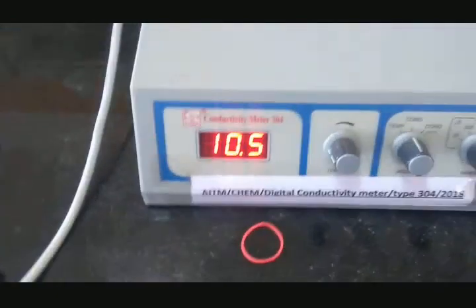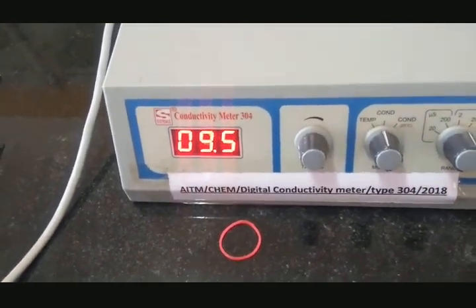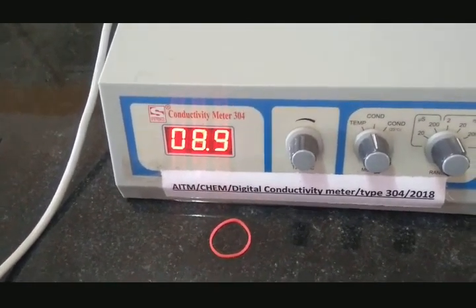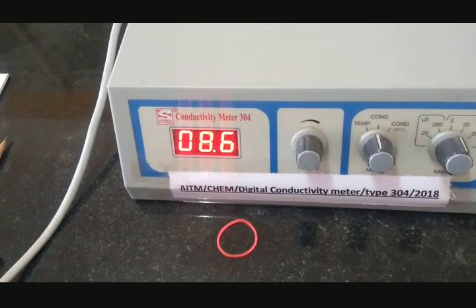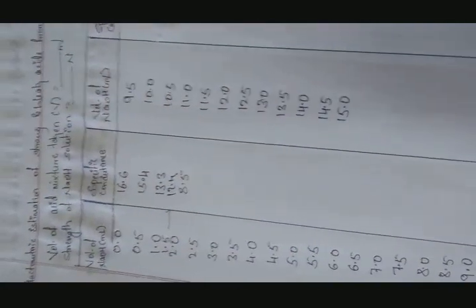Stir the contents and note down the change in the conductivity. So now it is coming somewhere like 9.4 or 9.3. It is decreasing consistently. Now you can see the consistent decrease, 8.5. So note down the value of 8.5.